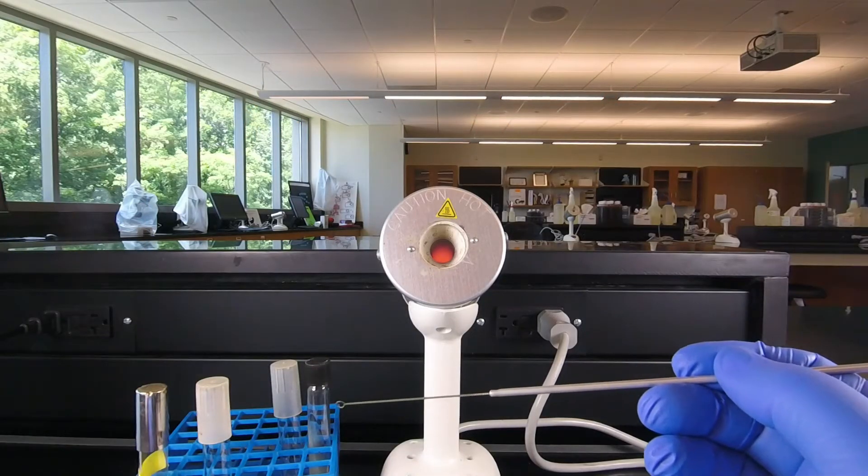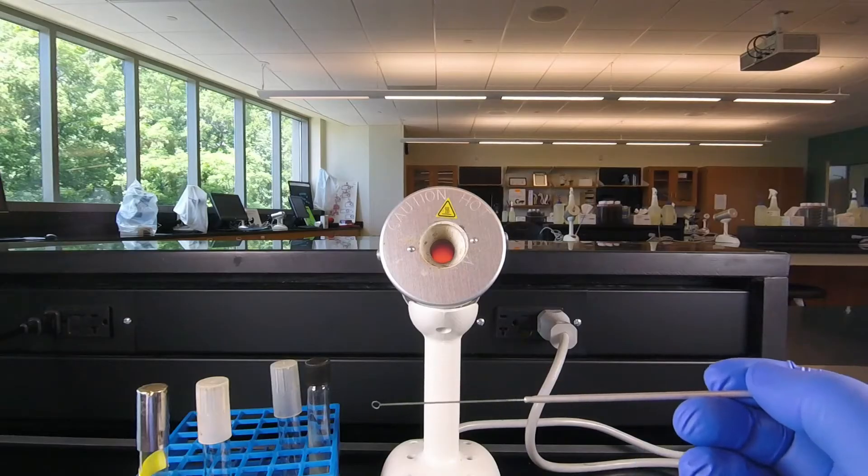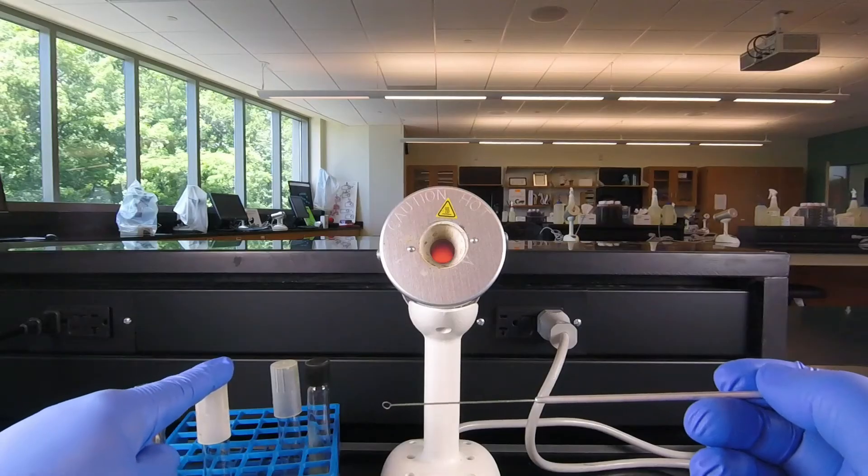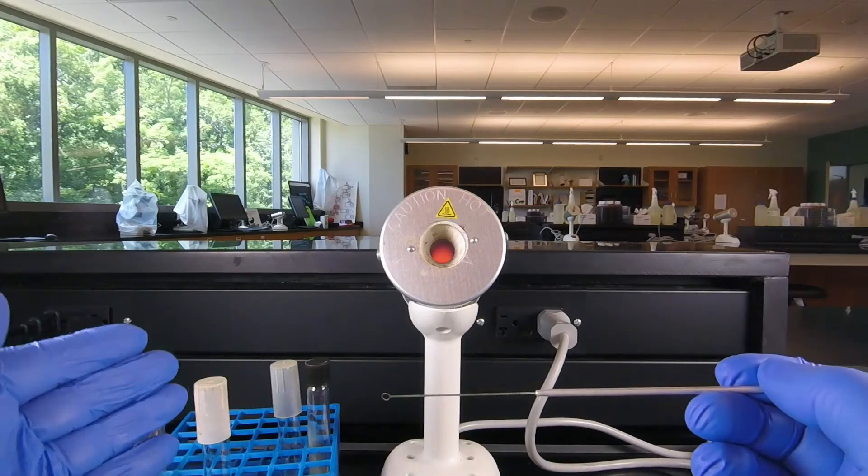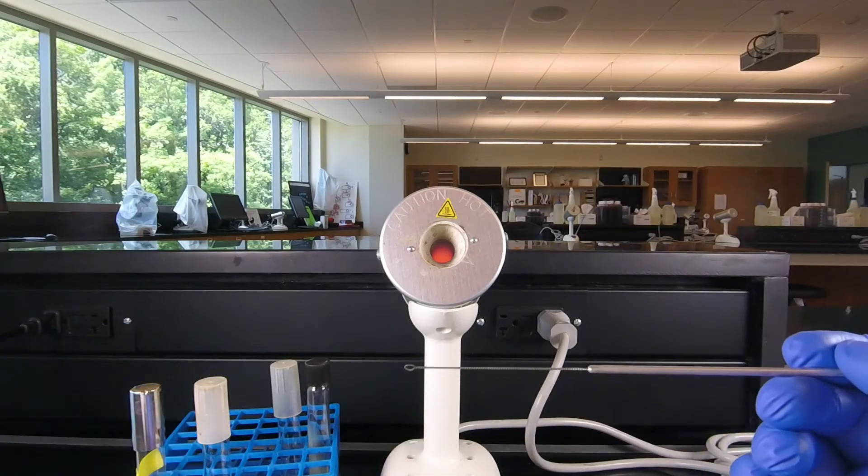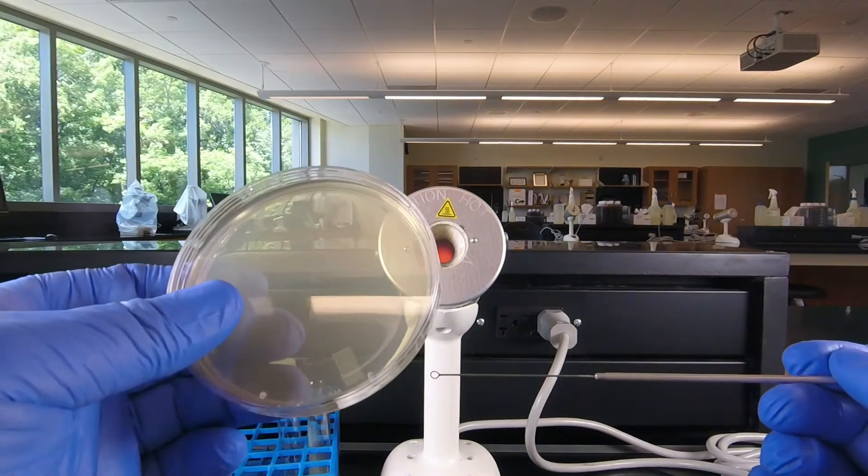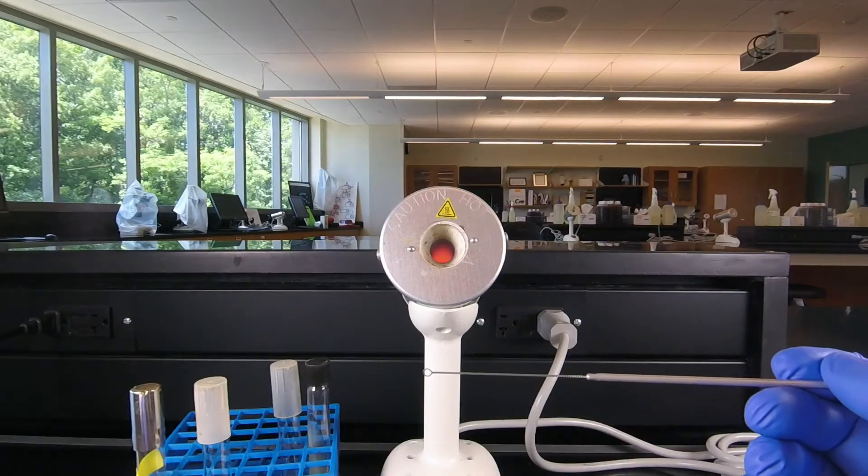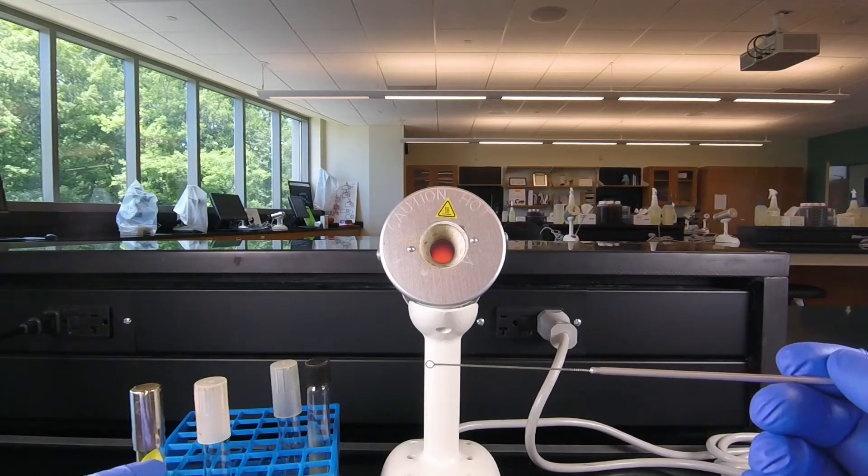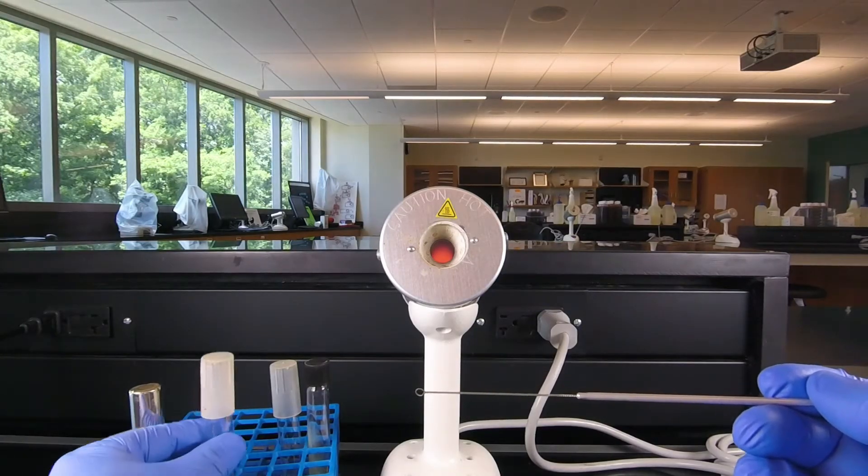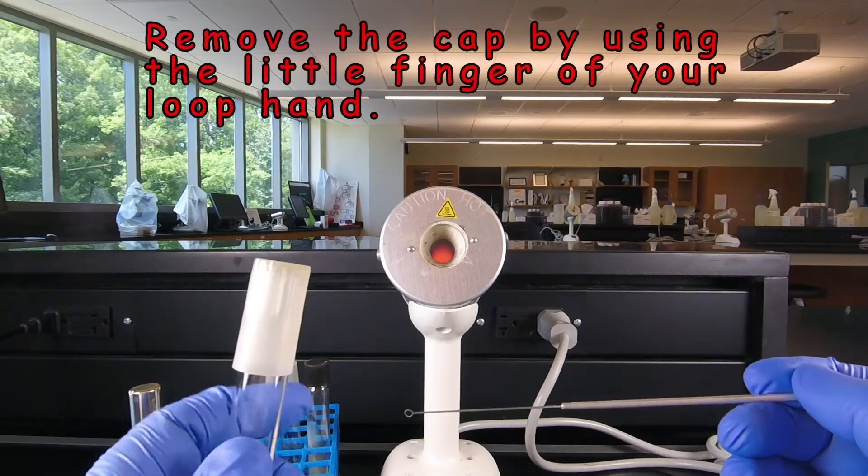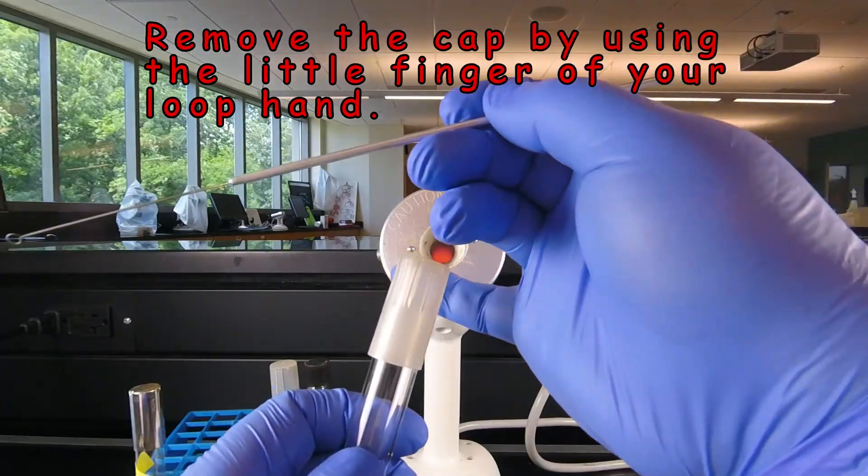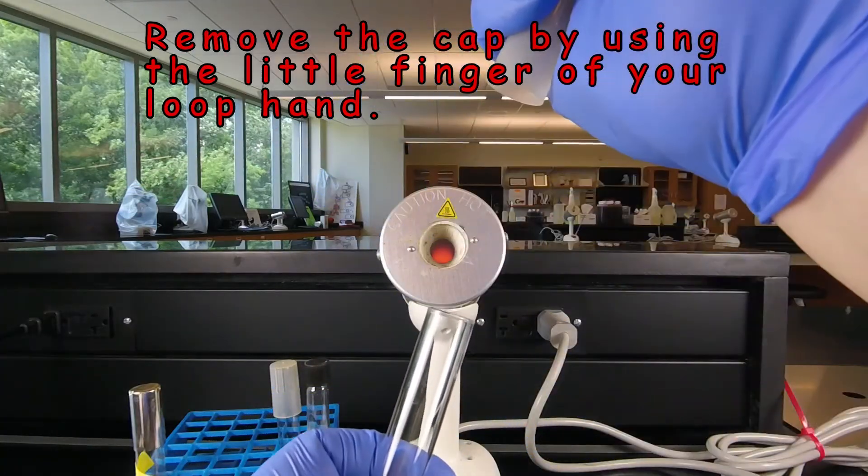Now it's important that we don't leave the tubes open any longer than necessary, only long enough to either get the bacteria out of the pure culture or into the tube we want to grow it in. The longer we leave the cap off of a tube or the longer we leave the lid off of a petri plate the greater chance contaminants are going to fall in and contaminate our cultures. So we pick up the tube by the glass and remove the cap with the little finger of the loop hand. We simply wrap the little finger around the cap and pull it off.